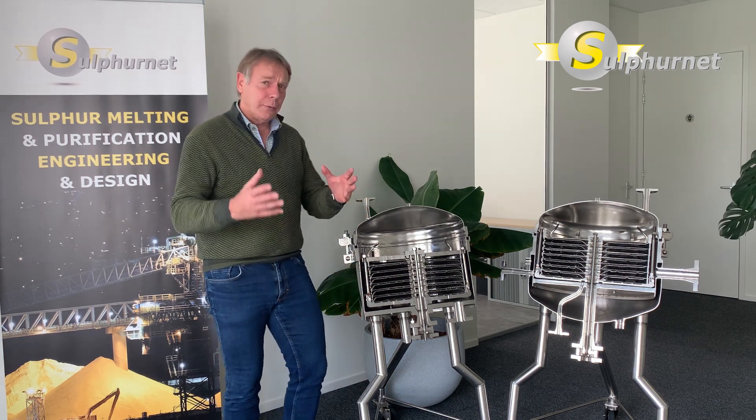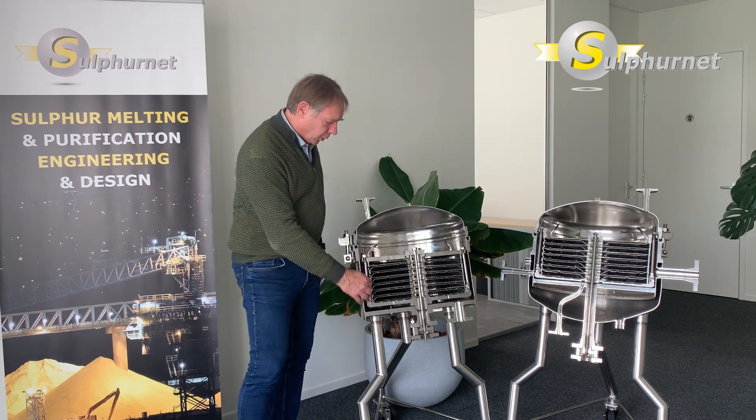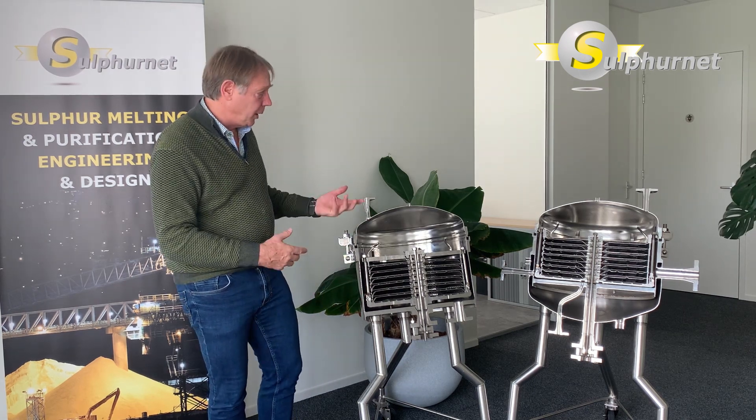In this filter, all the filter cake is encapsulated in the filter plate bundle and the solids do not come in contact with the tank. For instance, for activated carbon filtration, this is a very nice execution for cleaning purposes.